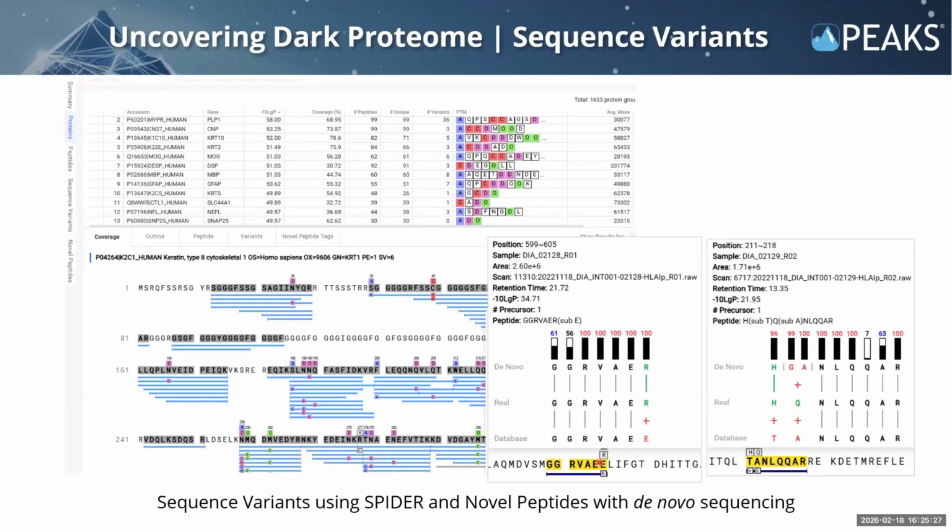And I think that this is really cool, as well as you can easily see this in Peaks Online and Studio as well, the comparison between the de novo and the database.